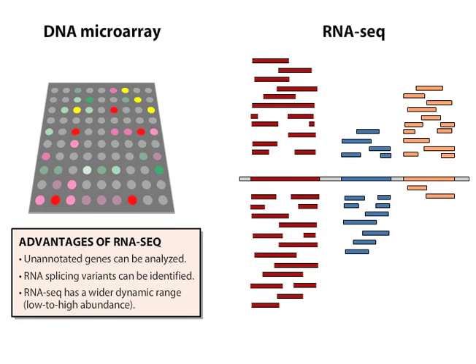RNA-Seq also has a wider dynamic range. That is, low-abundance transcripts that wouldn't be bright enough on a DNA microarray can be identified with RNA-Seq. At the other end, high-level transcripts that might cause signal saturation in DNA microarrays are fully counted in RNA-Seq. As RNA-Seq becomes cheaper and more familiar, it will likely eclipse DNA microarrays as the method of choice for transcriptome analysis.